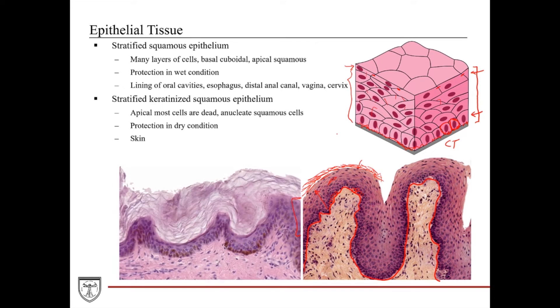Such an epithelium is found in our skin. Here's the connective tissue and the epithelial tissue. We can see the live compartment with cells and their nuclei, although the cells start to flatten out as we get closer to the apical surface. Beyond the live cells, we have this layer of dead cells — the keratinized layer — that is still holding on to the live cells underneath and providing all the protective functions. At the boundary between the live and dead cells, there are also lipid deposits that are effective at preventing water loss from the underlying connective tissue or water seeping in, forming a nice waterproof boundary for our skin.